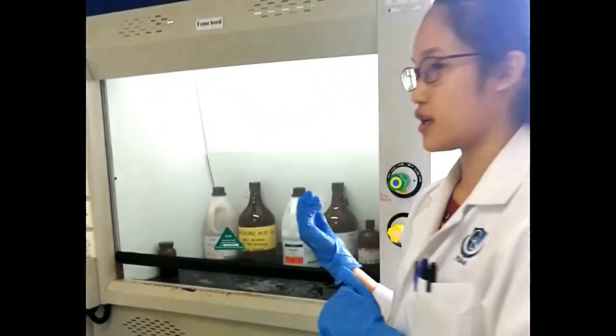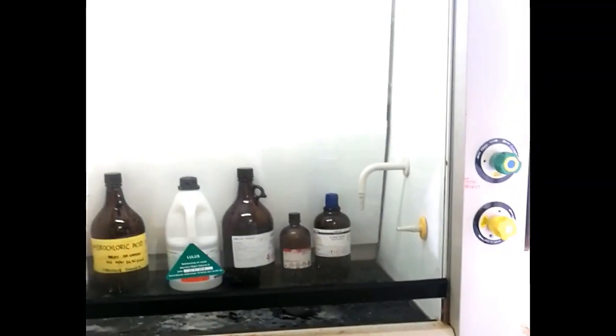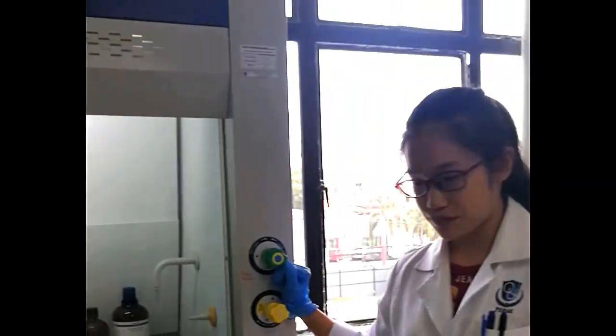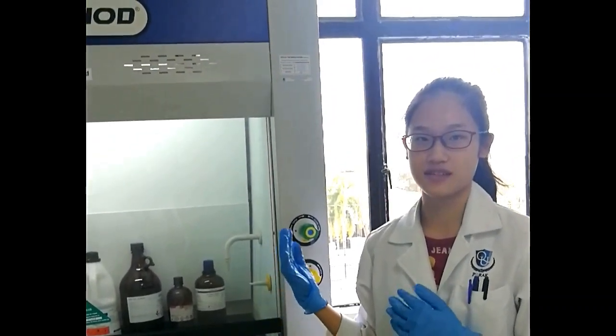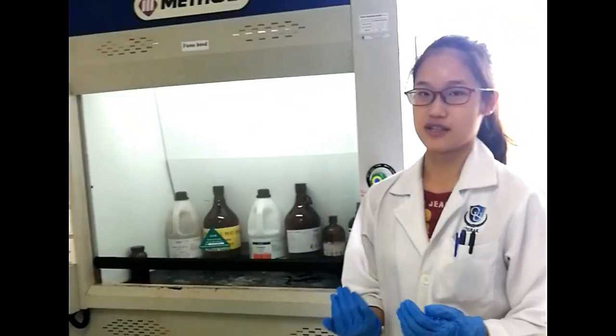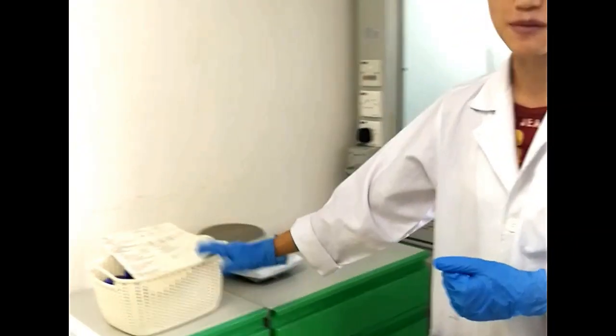So now I'm doing DNA extraction. Now I'm preparing the reagents. So I'm using the fume hood because I'm dealing with hazardous chemicals. And after that, I will extract the DNA from the Rhizobia using all the reagents that I have prepared now.